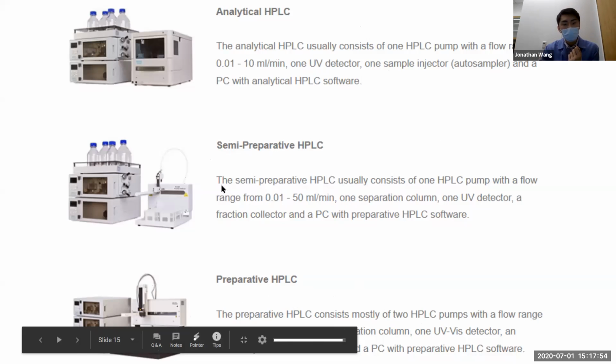And kind of in between, the jack of all trades but master of none, is the system that we have. It can sort of do both, but it's not super accurate, and not super large scale. So semi-preparative is the name for that.